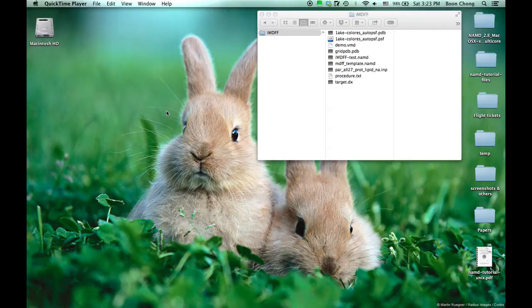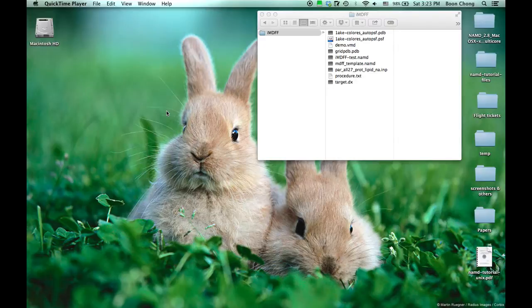If you go to the website and download the IMDFF files, this is what you'll see under the folder.